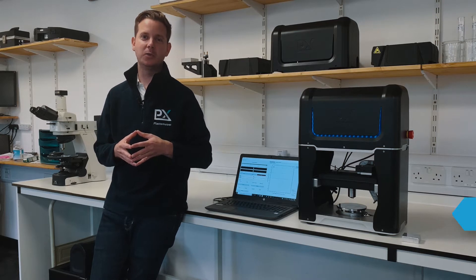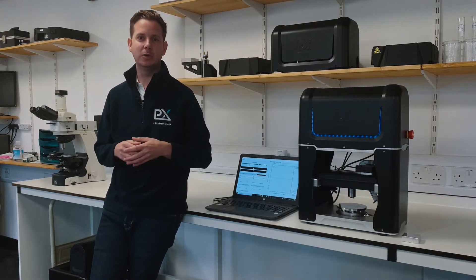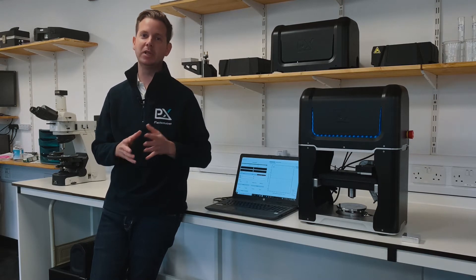Welcome to Plastometrex. We are a technology company based in Cambridge developing novel mechanical testing solutions. My name is James, I'm the chief exec and I'd like to tell you a little bit more today about indentation plastometry and our indentation plastometers.